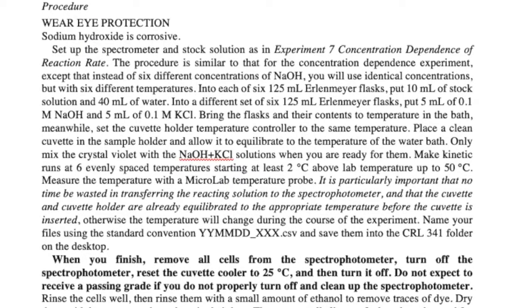And this is one of the things you'll see very often with heating units and their feedback circuits. They heat well. In fact, they heat a little bit too well and they'll blow through the temperature you set. So I always like to set the cuvette temperature to say 0.2, 0.3 degrees below the temperature I actually want. And then when it blows past that temperature, I can reset it to the temperature I actually want, because it takes a long time to cool back down. It heats up quickly, but it cools down slowly.